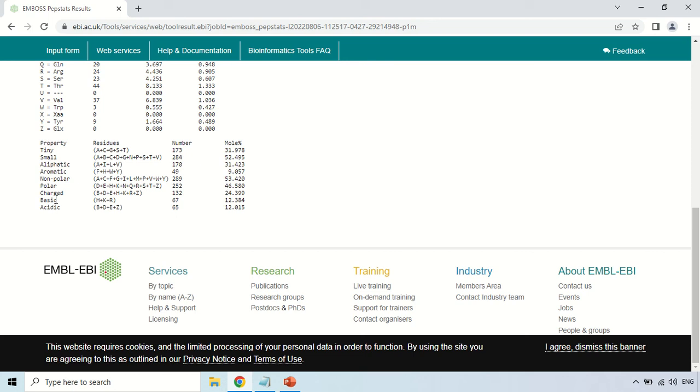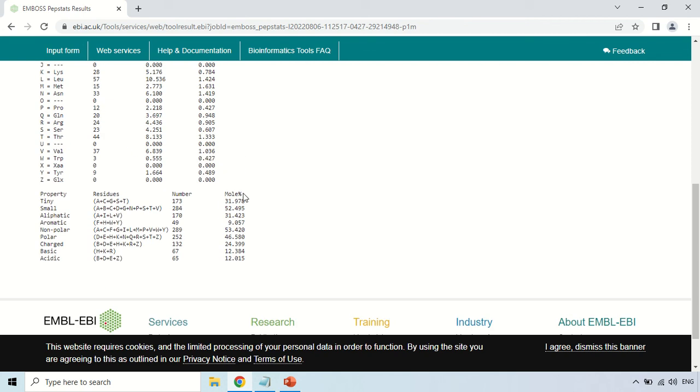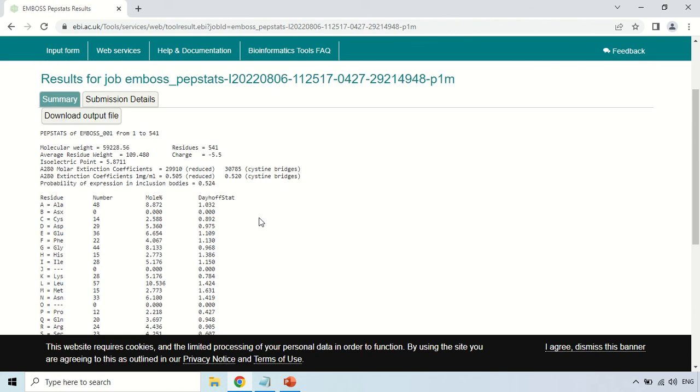Charged amino acids, there are 132 charged amino acids, their molecular percentage is 24.399. Basic amino acids, there are 67 basic amino acids and there are 65 acidic amino acids. These all are the physiological properties of your protein and this is the composition of your protein by the number of amino acids, the molecular percentage and Dehoff stat, and these are the basic properties of the input sequence.